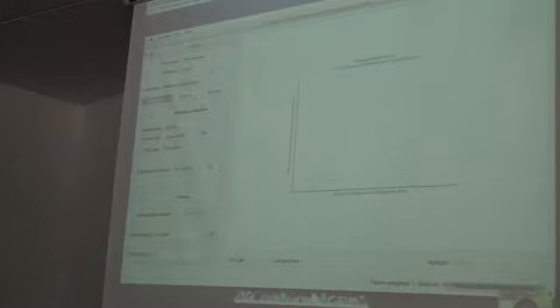Okay, so I'll show you a couple things first. One is the group legend. Let me just pick this for a second. So the first thing you notice is that we have a group field, so this is where you can select now whatever your metadata, your mapping file contained. So you can choose disease state or age group, and when you select that, things are updated to now represent the samples that way. So I'm just going to use these three age groups to sort of demo this, and then I'll hide that and move it out of the way.